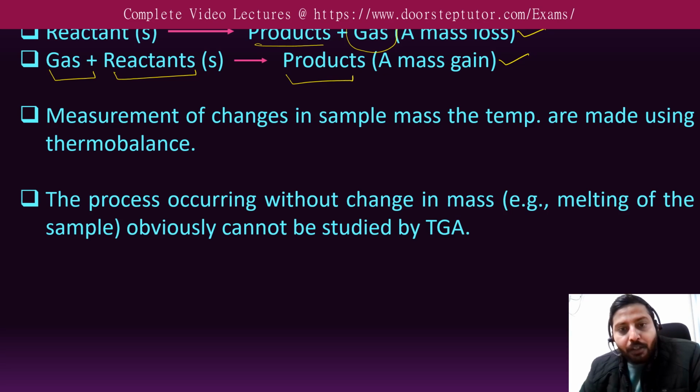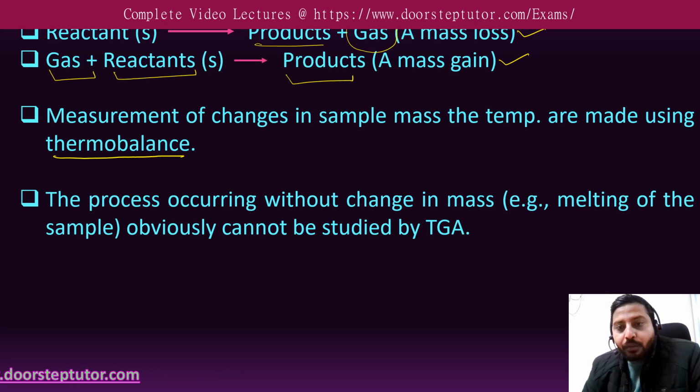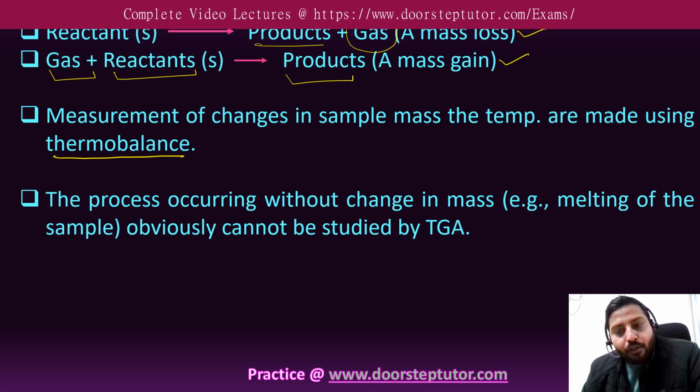The measurement of change in sample mass with temperature is made using a thermobalance. So how is it measured? We measure the mass as the temperature changes. The thermobalance measures the mass of the sample while the temperature is changing at a constant, controlled rate.